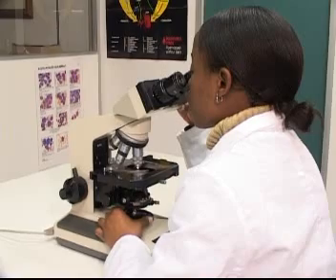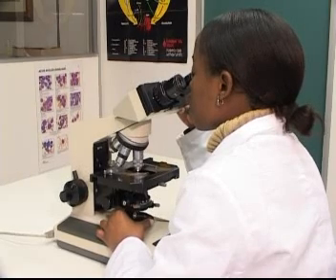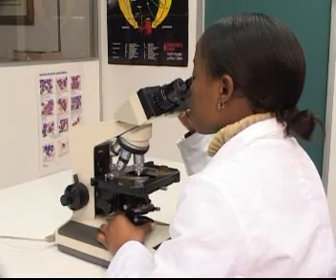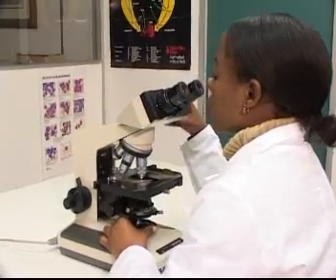In some cases, you may find that there is too much or too little light to view the image clearly. You can then use the diaphragm to regulate the amount of light that passes through the object. This is the diaphragm, and what it does is increase or decrease the amount of light reaching the slide.